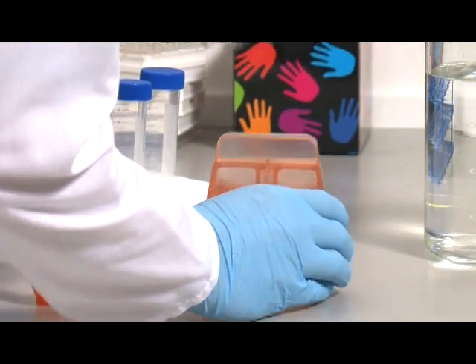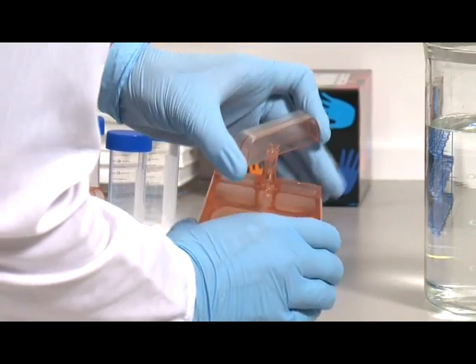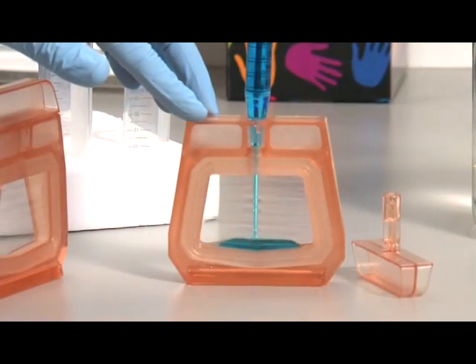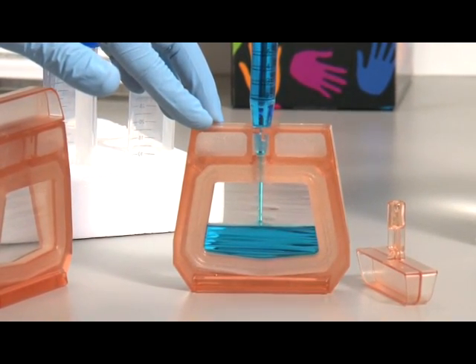Open the sample port by gently twisting the cap counterclockwise until it stops. Then lift the cap off. Pipette your sample into the Slide-A-Lyzer G2 cassette.